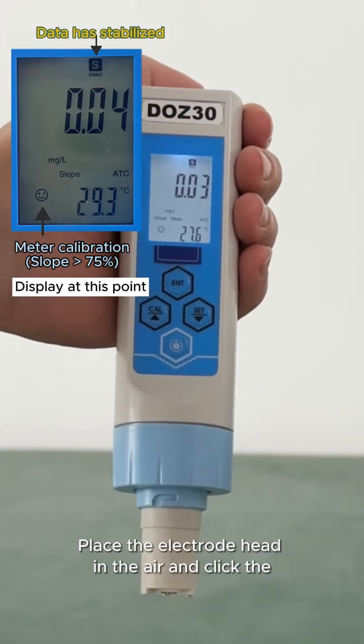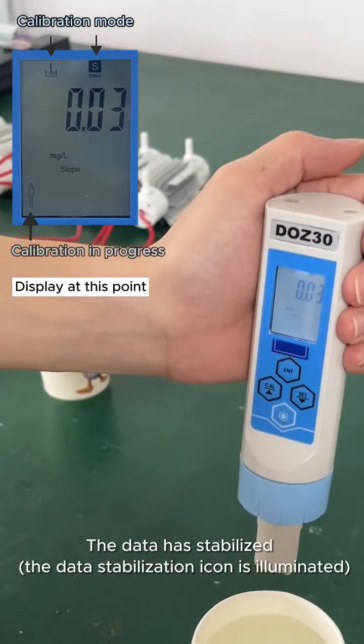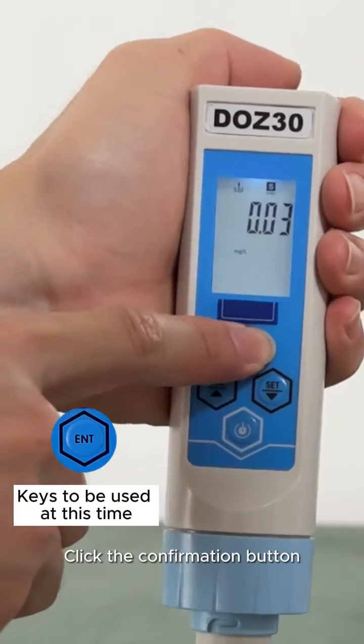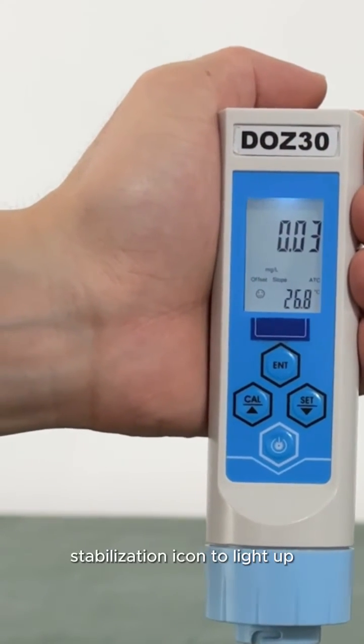Once the data has stabilized, place the electrode head in the air and click the CAL button to enter calibration mode. Wait for the data to stabilize — the data stabilization icon will be illuminated. Click the confirmation button; the air calibration data is entered successfully.